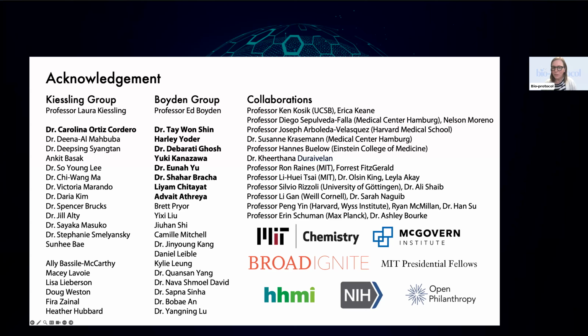There's a question. How about the limit of the thickness of, for example, brain slices for a DMAA gel? What would you consider being the upper limit? 100 micrometers or 200 in your experience? We have tested up to 100 micrometers, but we haven't tested thicker tissue than that. The main limit is whether the diffusion can fully go through the center of the tissue. For that, you might have to optimize the gelation solution further to slow down the gelation.